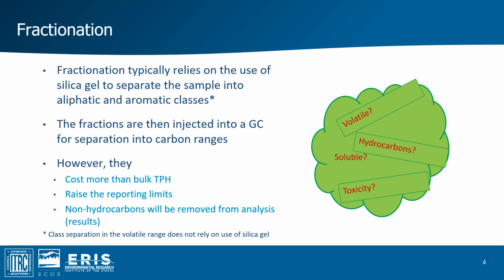Fractionation can be applied to all matrices: NAPL, soil, water, and gas. But it is not typically necessary or recommended for water, because years ago there were a number of studies performed that allowed us to easily predict the hydrocarbons in the water phase. Caution should also be used if fractionating soil gas samples, and an alternative fractionation method that does not require the use of silica gel for volatiles should be considered.